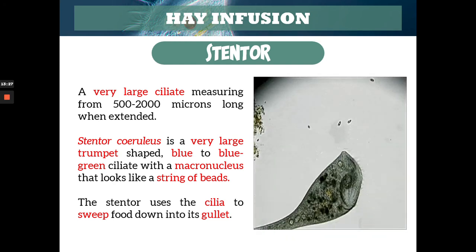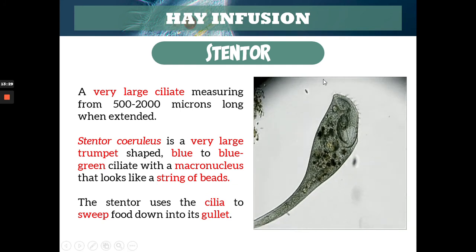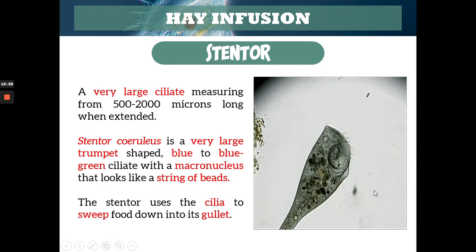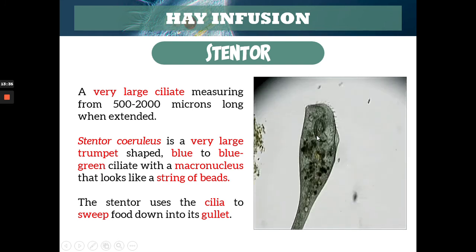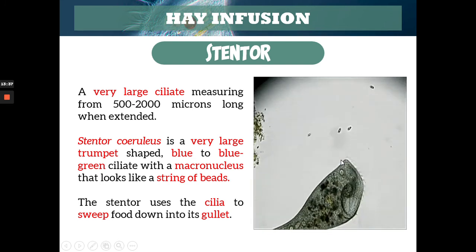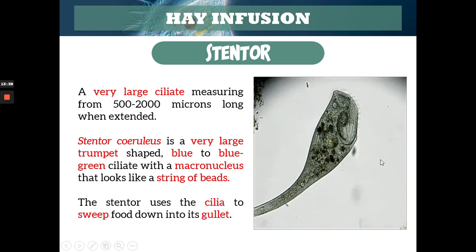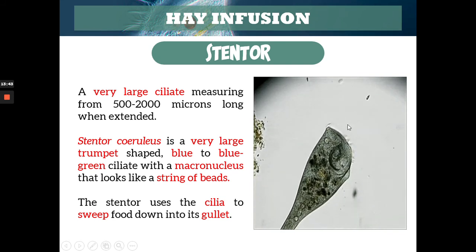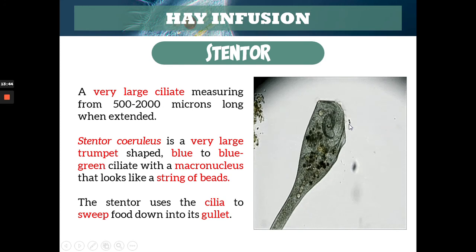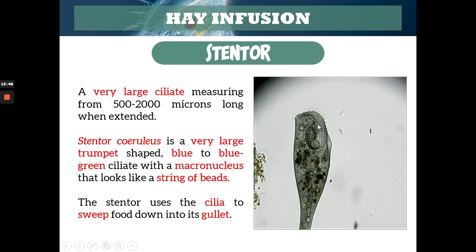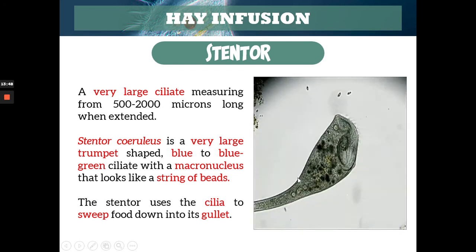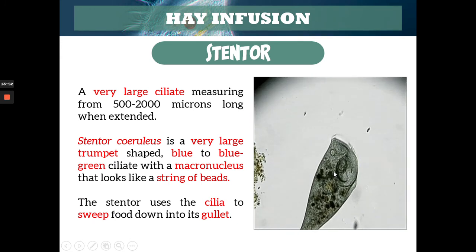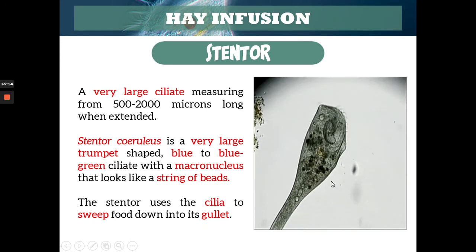Here's an example of a stentor. As you can see, yes, it looks like a trumpet. The one at the top — you can see the cilia moving. And this is its gullet, like an esophagus for food. The cilia here are used by stentor to get food and bring it into its body down its gullet. That's stentor — it looks like a trumpet, a very large ciliate.